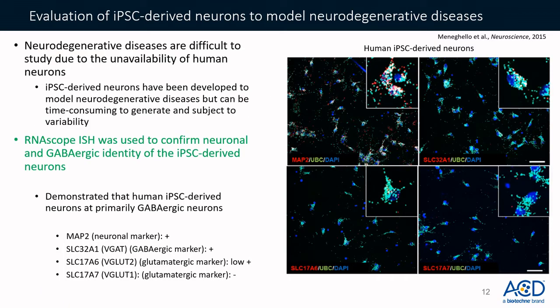This is another paper where iPSCs, or induced pluripotent stem cells, were known to become an important tool for modeling and investigating human diseases as well as for screening drugs. So really important in drug therapies or screening of drugs. Now, following differentiation, thorough molecular characterization of the cellular identity is critical. RNAscope technology is well suited for confirming the cellular identity of iPSC-derived cells.